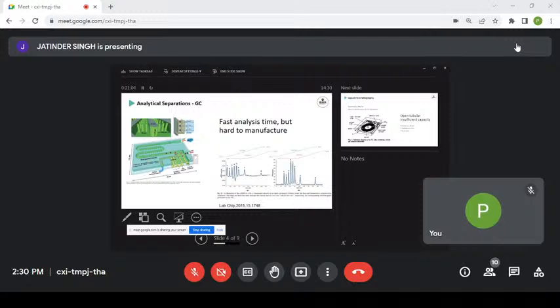If you've got an analyte that doesn't have a high affinity for the stationary phase, but likes the mobile phase a lot better, it won't be strongly retained because it spends more time in the mobile phase than in the stationary phase. That means its retention time will be very short and it will come out as the first analyte. Here we can see something called the chromatogram that we've seen this morning, where this one has a short retention time and comes out rather quickly. This one here is a slow one, so it really likes being stuck to the stationary phase. So that's the way chromatography works.